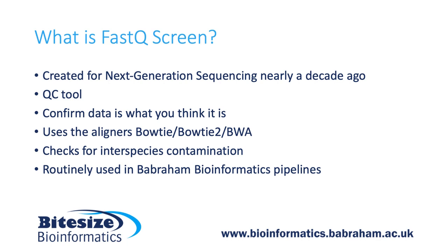Also, the tool has been invaluable in identifying samples that are contaminated or not containing what they should in some other way. For these reasons, we have integrated FastQ Screen into many of our bioinformatics pipelines, and in so doing, samples which come off our in-house sequencer are routinely screened by FastQ Screen.